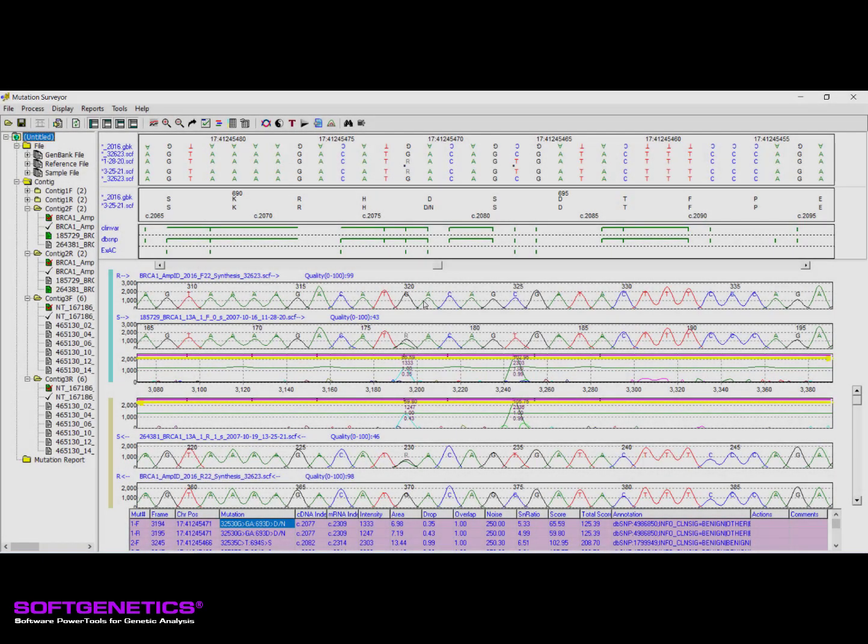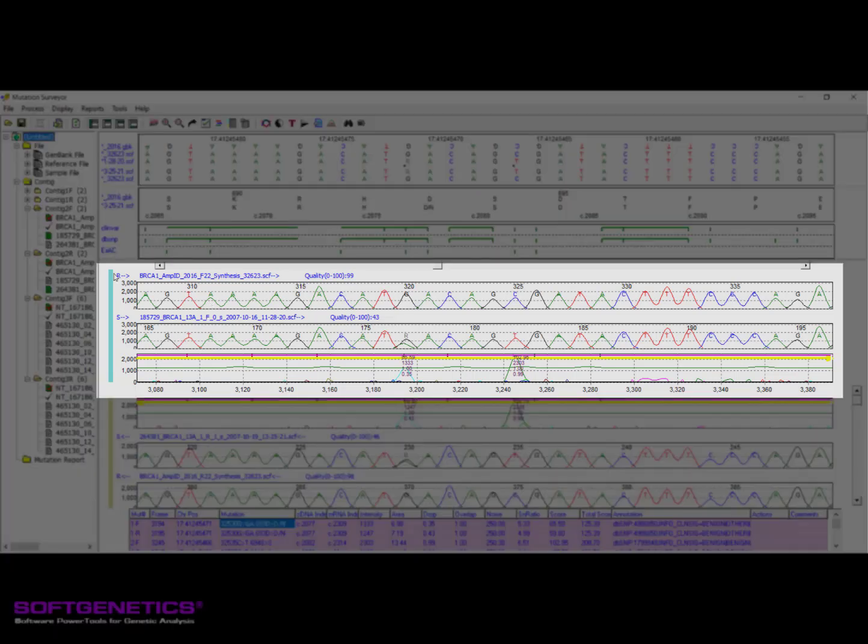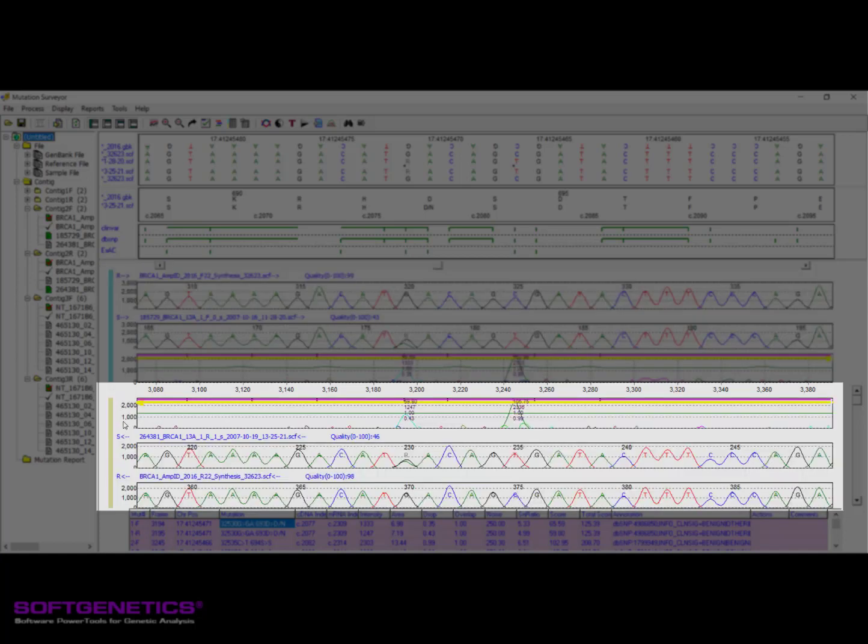The Sample Traces pane, also known as the Electro-Pheragram pane, displays the traces for a selected sample. When working with bidirectional samples, the traces will be grouped by direction. Traces to the right of the blue vertical bar represent the forward direction, and traces to the right of the tan vertical bar represent the reverse direction.